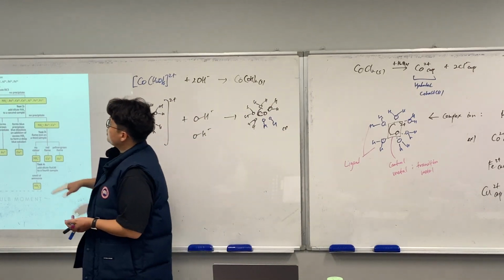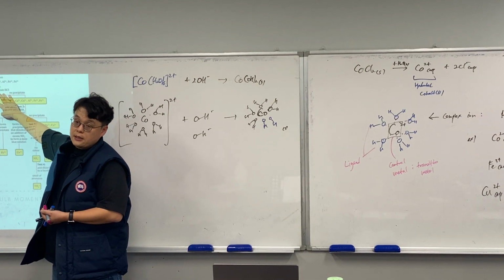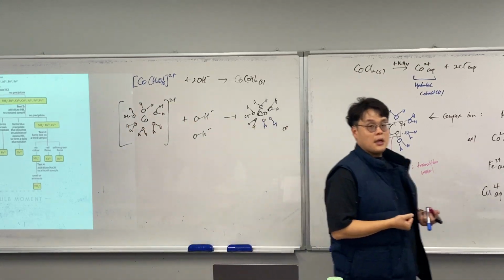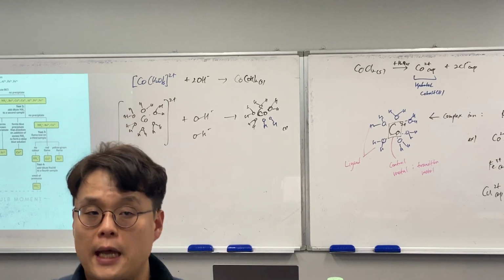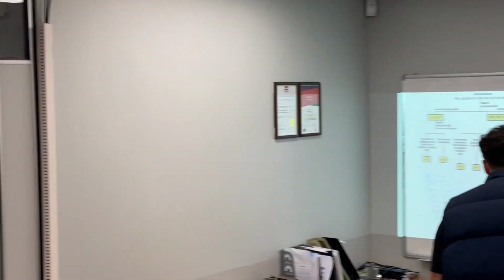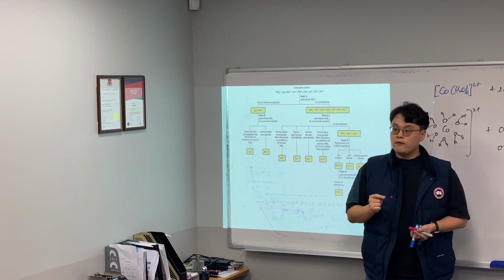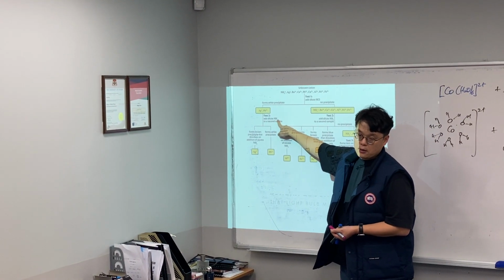In a case where we have unknown cations, we can test one. We can add some hydrochloric acid. Now, what we know about hydrochloric acid, chloride to those cations, chloride will only form the precipitate with lead and silver, those two only. Then, if a white precipitate is formed, we know that it must be either silver or lead. Then what you do in the second, the confirmation test, is add some diluted ammonia into it.